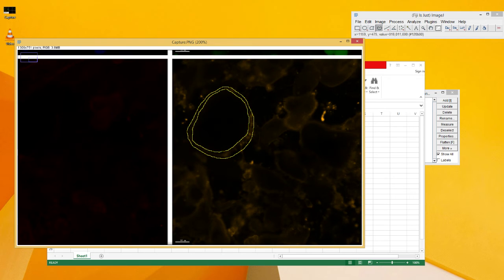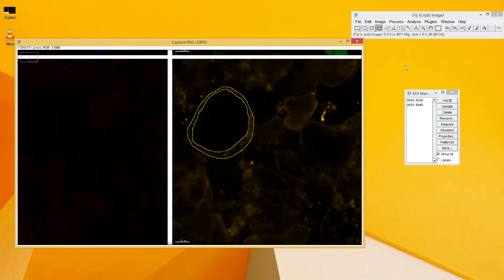For example, this one, I can trace these. I'm just going to trace a couple more and show you how it's going to look once you have several cells. Obviously it's going to take a little more time. I don't know if you need to continue doing the thresholding, but hopefully this is a suitable workaround. I'm not sure if there are any plugins to do this. If there are, that would probably be the best because, like I said, it's kind of subjective doing this.